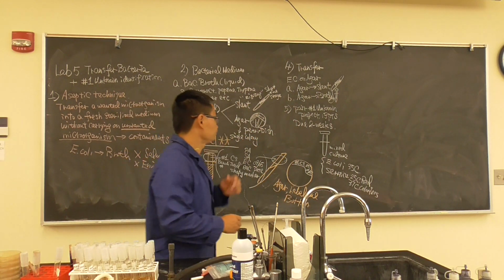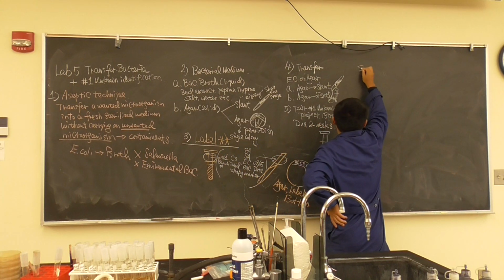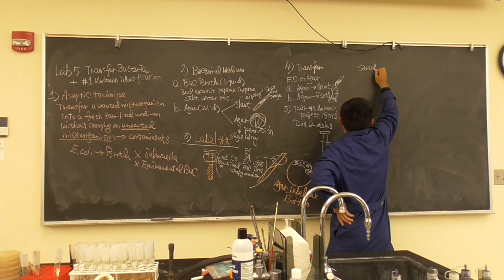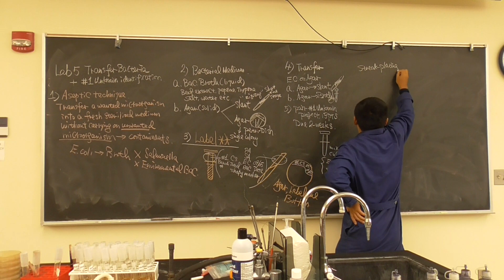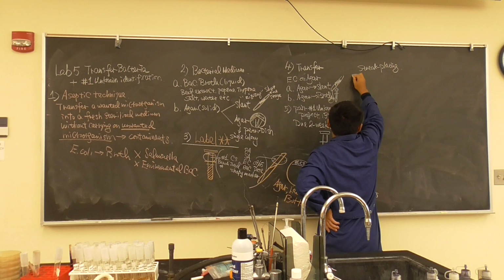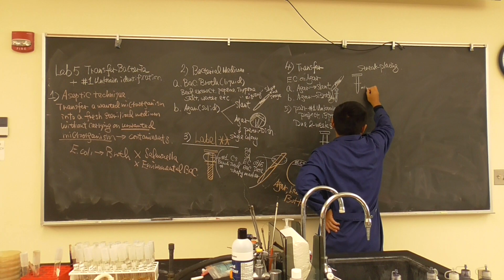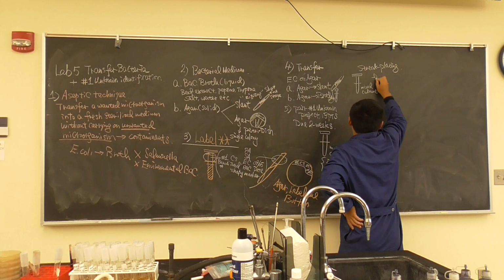So how are we going to do it? First thing first is streak plating. When you get this mixed culture, the first thing first is shake.